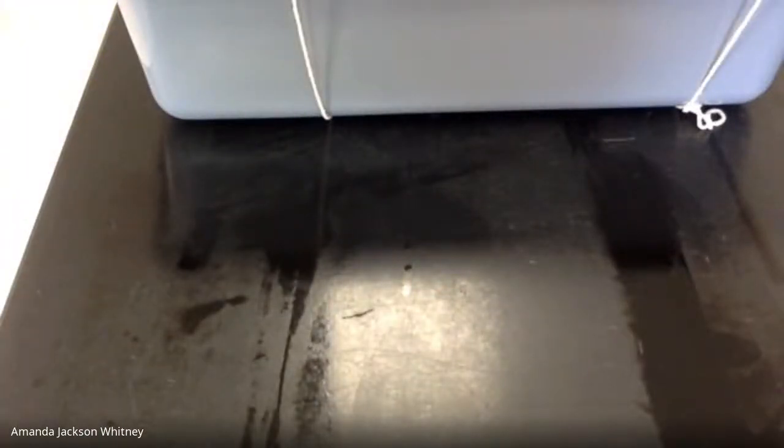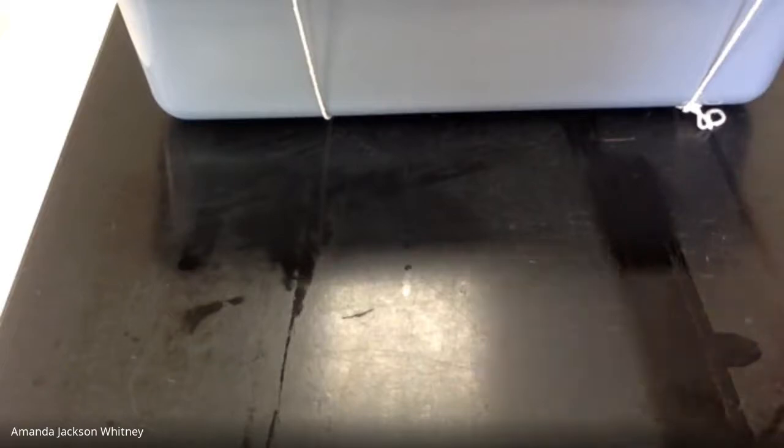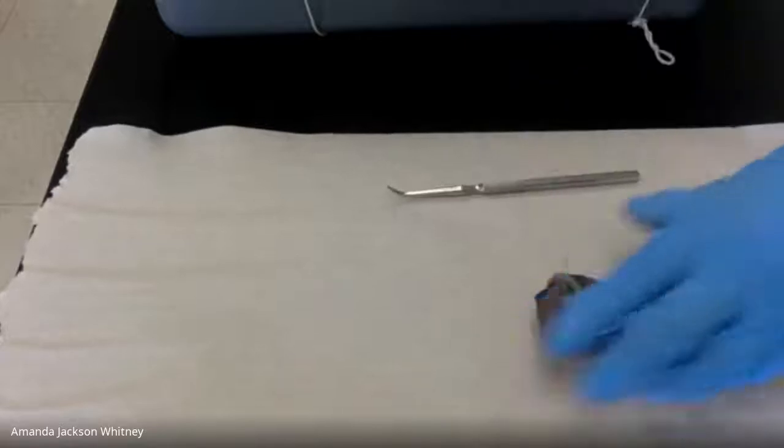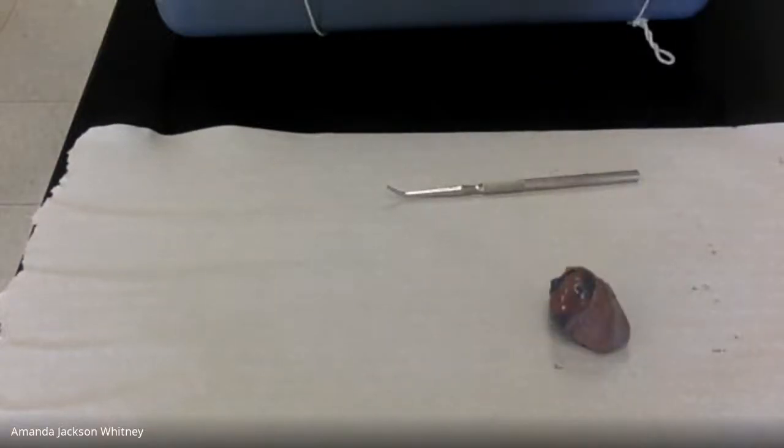You got your intestines unraveled? Woo! You guys can put those aside, and I'll take a picture of you later. Wait, so for the stomach? Yep, just cut it open. Get a different chair. If you guys want to move on to cardiovascular. I usually help with the stomach. Do me a favor, put the stomach off to the side and go ahead. Yeah, that's what I'm gonna do. But how do I cut through this hard stuff?